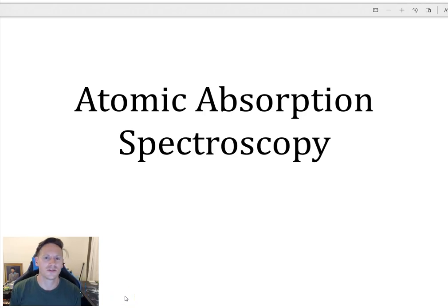Hi chemists, just want to talk you through some atomic absorption spectroscopy. Now this is the last subtopic for topic 1 in the Year 12 course.